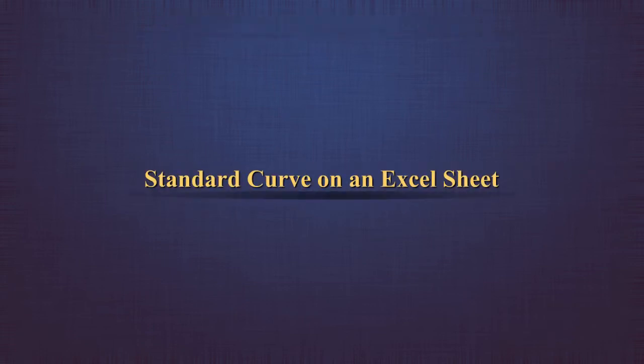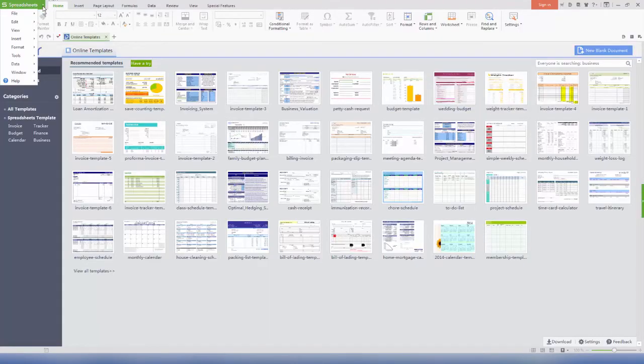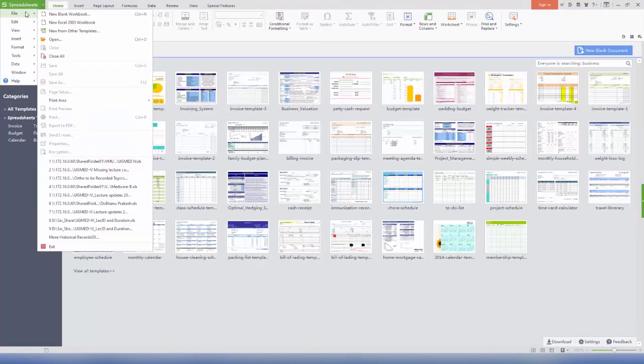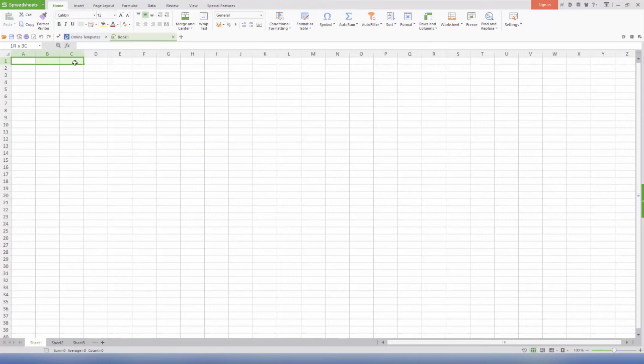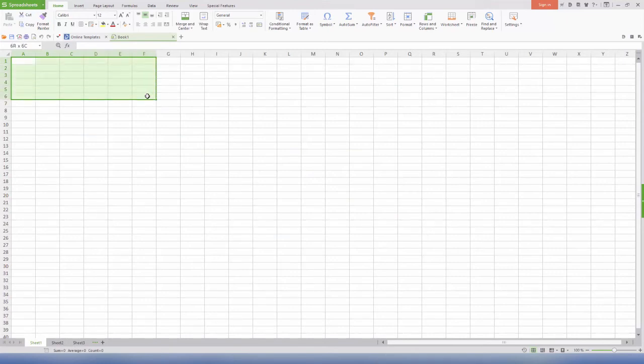The standard curve on an Excel sheet. Open a new Excel file. Select the 7 rows and 6 columns, that is A, B, C, D, E, and F.